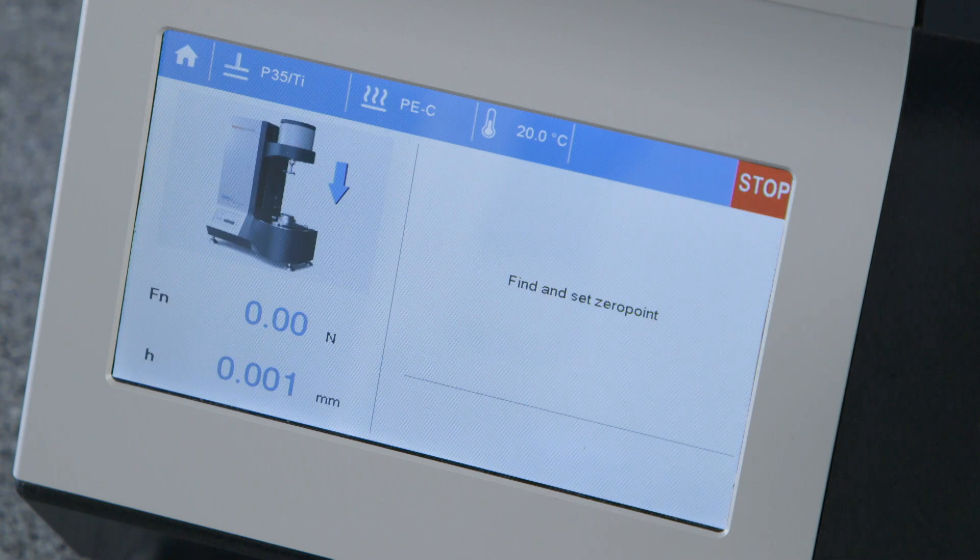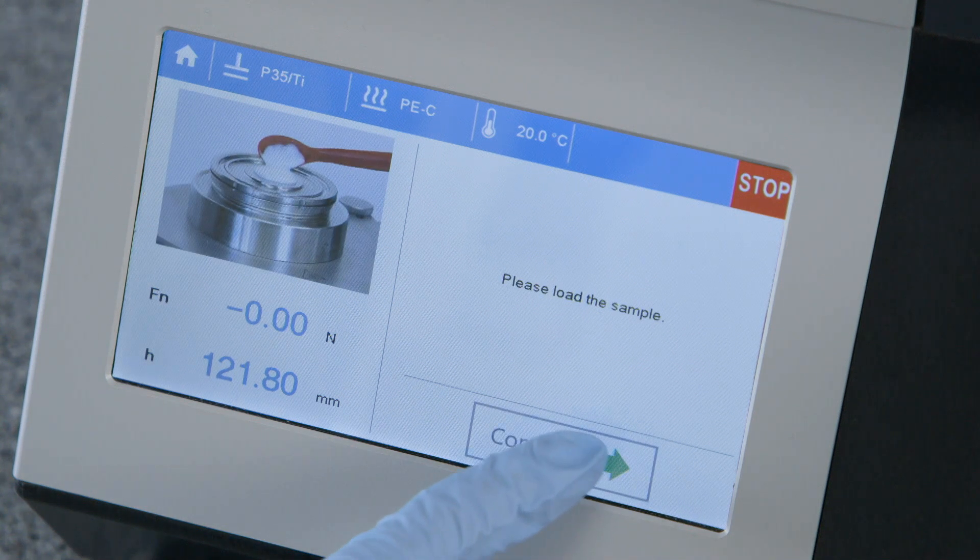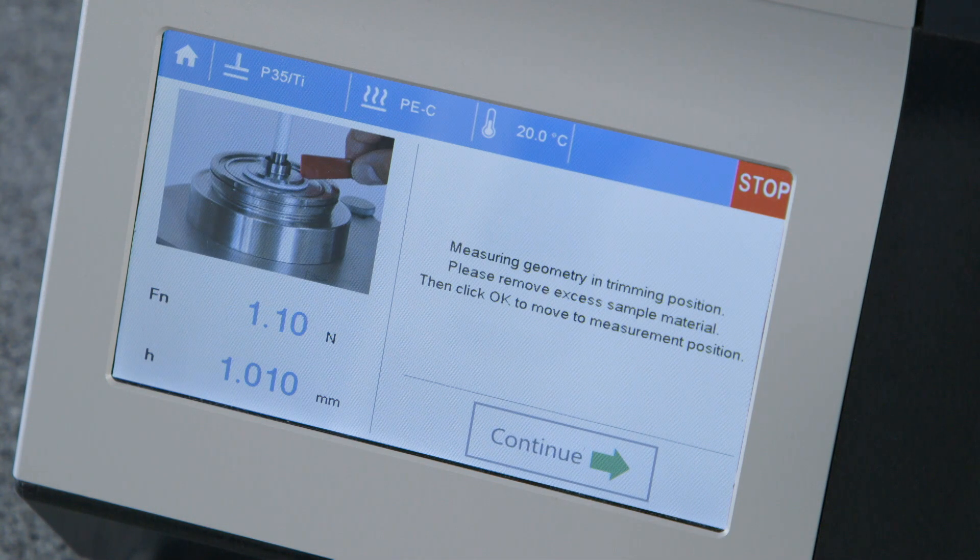This user interface with multifunctional 7-inch touch screen guarantees standard operating procedure right at your fingertips.